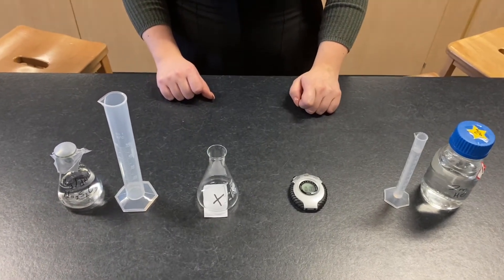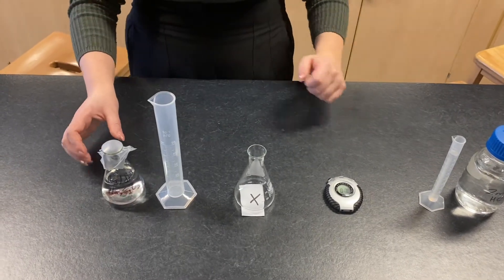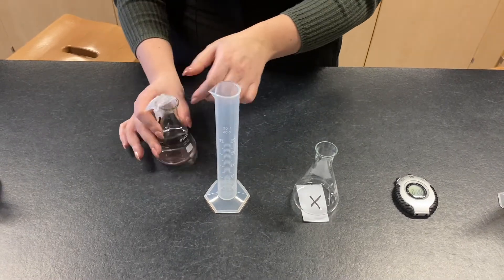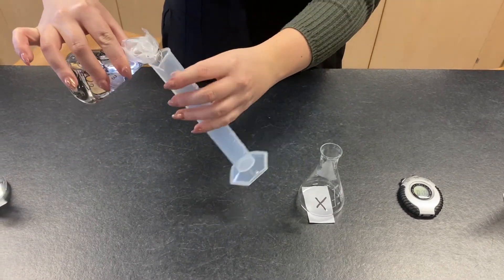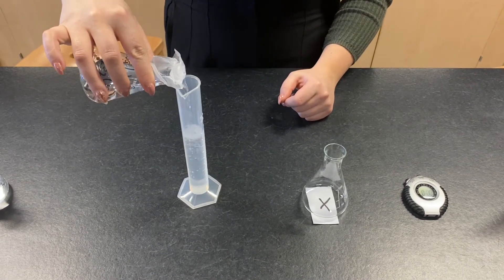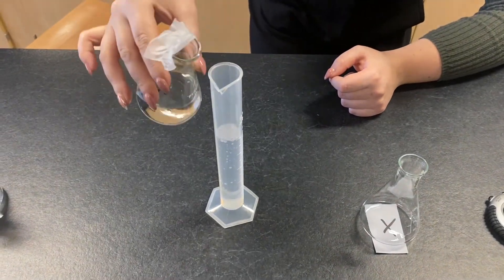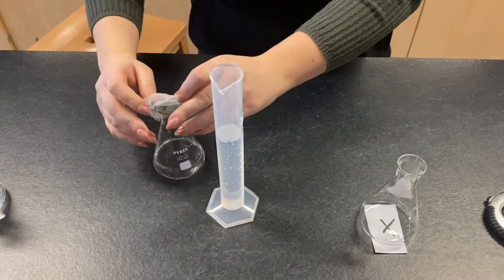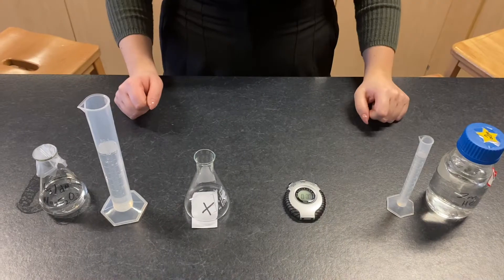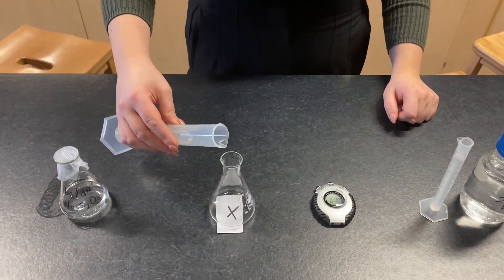The first step, we're going to pour our sodium thiosulfate into the measuring cylinder and measure out 50 millilitres. Then we're going to pour our 50 centimetre cubed of sodium thiosulfate into the conical flask.